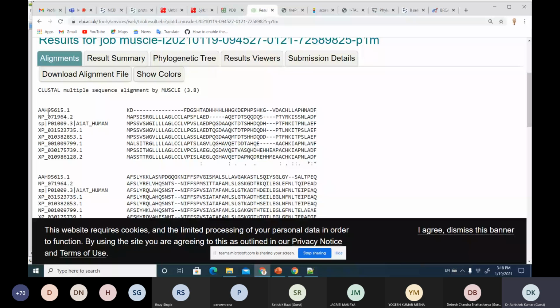Only for like say alpha 1 antitrypsin underscore human, it is visible. Only one of them. So it is advised that we clean the sequence and rename the sequence when you're doing phylogenetic analysis so that there is a meaning. Since this is a practice and this is a small number of sequence, we can still manage.